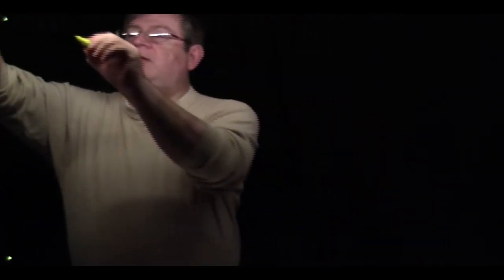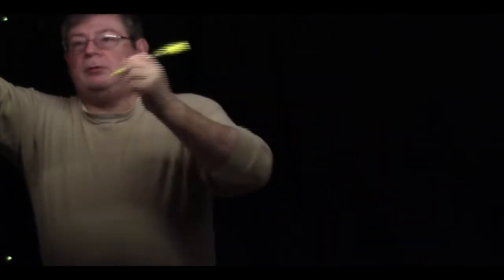Okay, so let's look at another set of experiments that we can easily devise using mass spectrometry. And again, I'm going to focus largely on electrospray because I think it's the most versatile of the techniques for doing these types of experimental designs. But we can actually devise what are known as T-joint. Whoops, let's see if we can get my pen to work here.